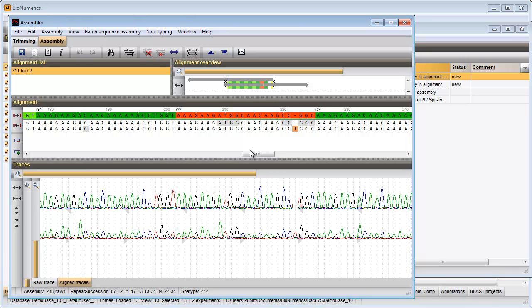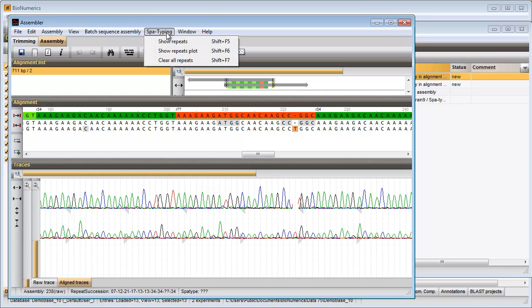One repeat has a red color. I can have a look at the nearest repeat matches with the menu items, spot typing, show repeats plot.